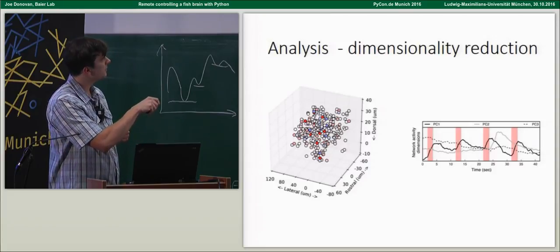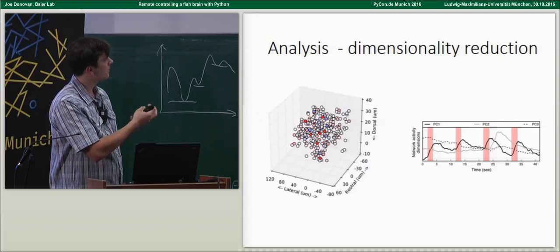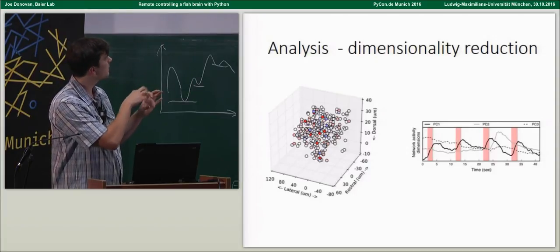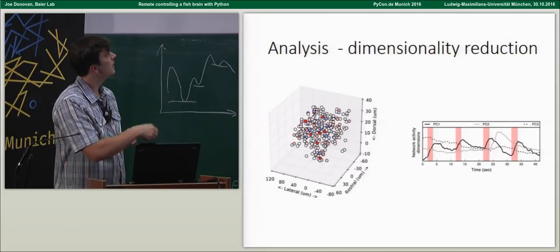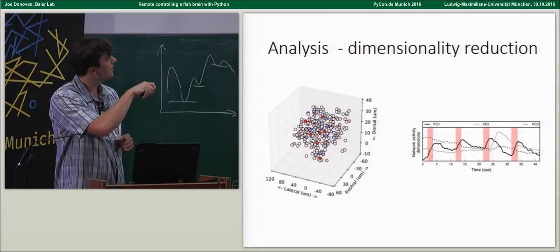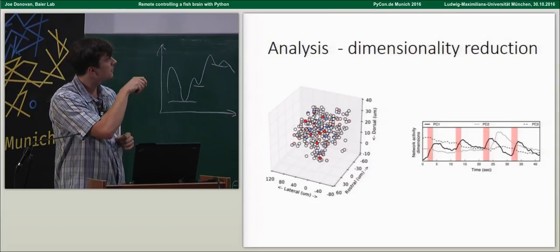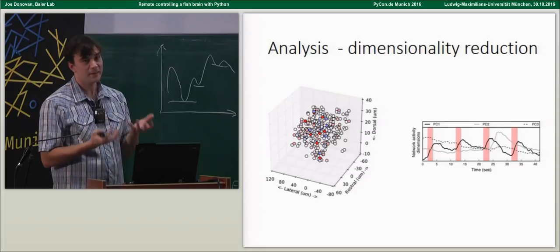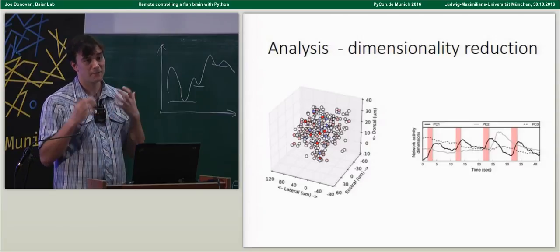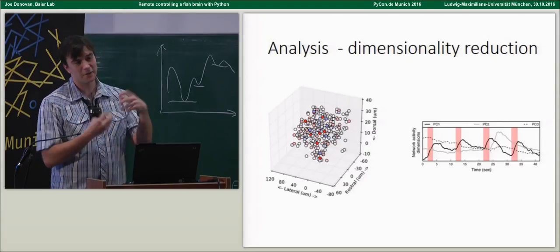You can see here that this bold component is active when the stimulation is active. This includes, for instance, the neurons that are being stimulated and some of the surrounding neurons that are very highly linked to them. There's another group of neurons that's spread throughout the circuit much more broadly that's activated by the larger swimming behavior. And then there's some slower changes in the network state. This is another problem: in a nice mathematical model, everything stays the same. But in a real-life brain, as you go in and start to poke stuff and activate neurons, other neurons adapt.